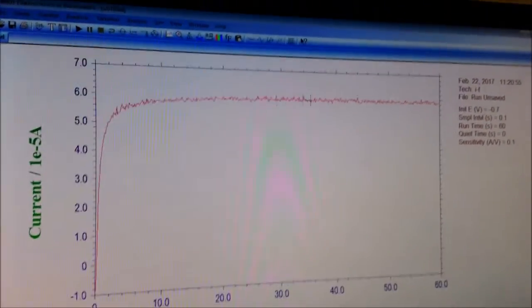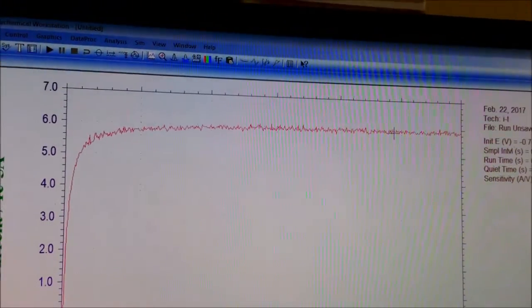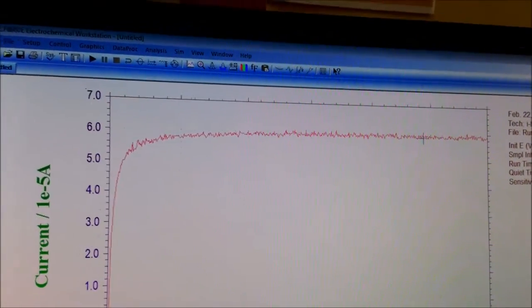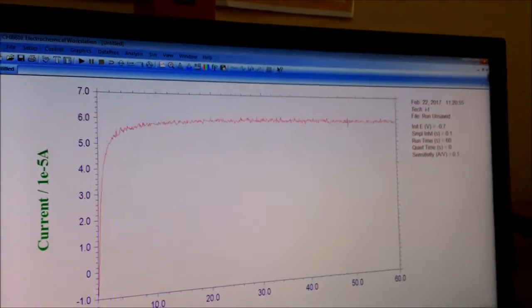You can find this curve. This is how you can electro-deposit something on the working electrode using the CHI 660E instrument.